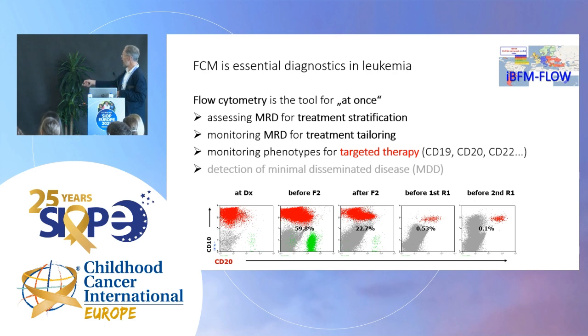This was a relapsed case, CD20 in that direction, only a few cells, the rest is actually negative. You would say this is a CD20 negative case. You would say, okay, CD20 intervention doesn't work. But if you look at what remains throughout the therapy, it is actually a residual disease which is fully CD20 positive. So it really makes sense to follow the leukemia not only for quantities of blasts, but also for profile. So for example, those blasts would be amenable to rituximab interventions.